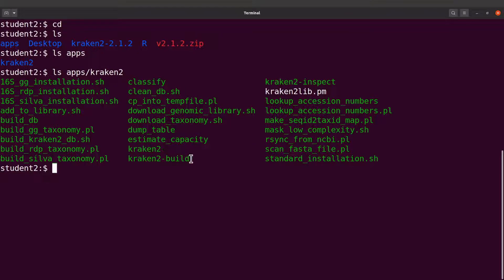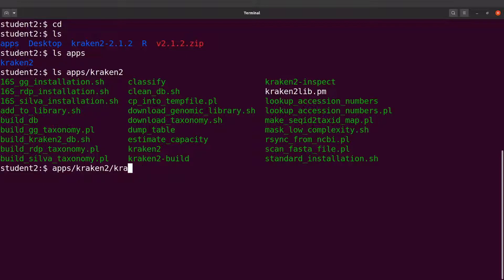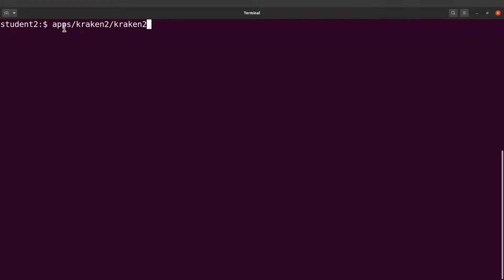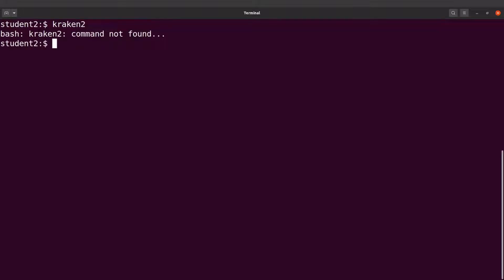With the current setup, if we want to run Kraken 2 or execute any of the scripts, we need to specify the full path. For example: apps/kraken2/kraken2 — let's test this command. It's working fine. But with the current setup we always have to specify the full path, which can be problematic if we're working in different directories. We want to be able to just call kraken2 directly and have it execute.